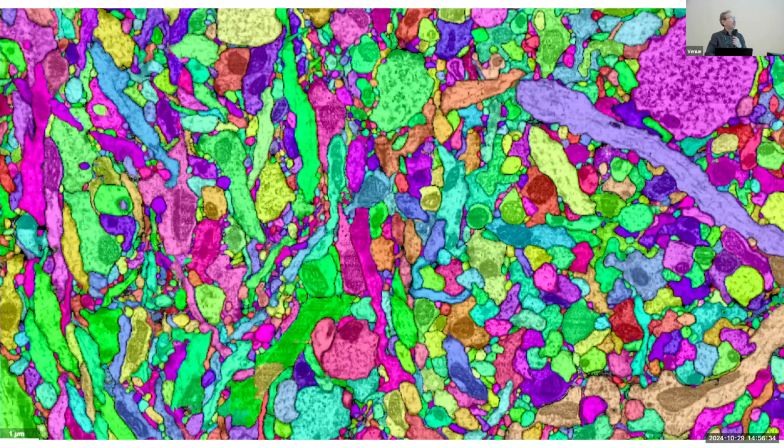And so we collaborate with Google AI in order to do these initial stages, and they can spend massive amounts of money doing this with all of their clusters. And then we'll also supplement this with information on our synapses. And if we zoom in a little bit more, you can see that each of the voxels is pretty well differentiated in terms of where the neurons are. This is pseudo coloring, but each of these different colors represents a unique integer that represents a three-dimensional structure.